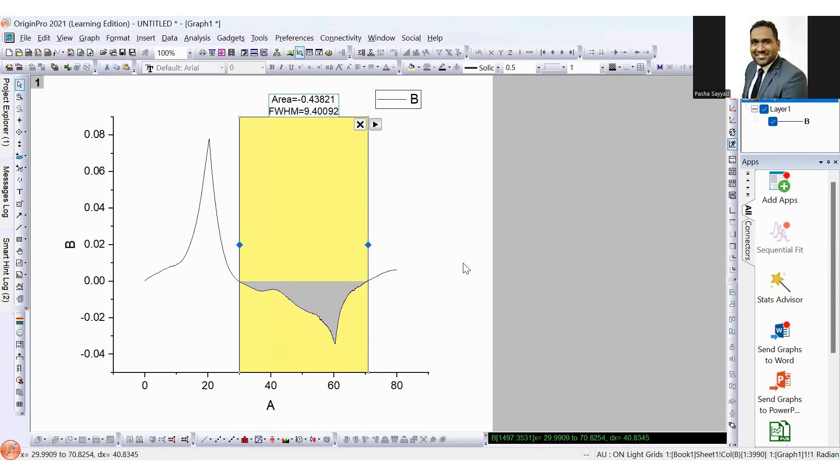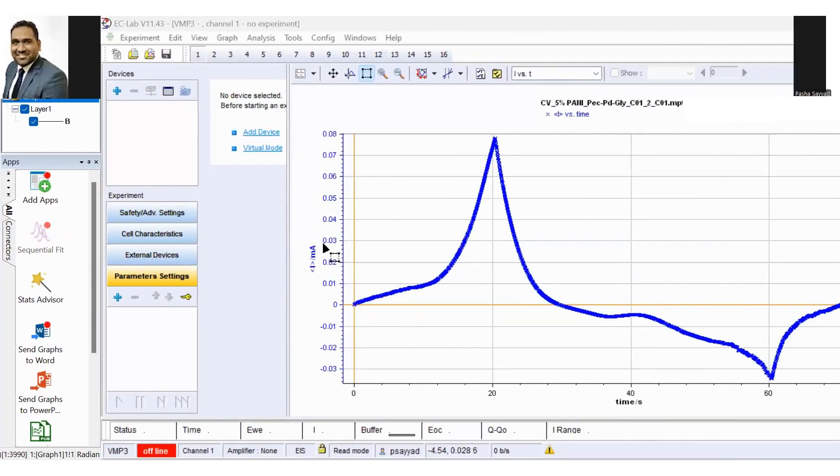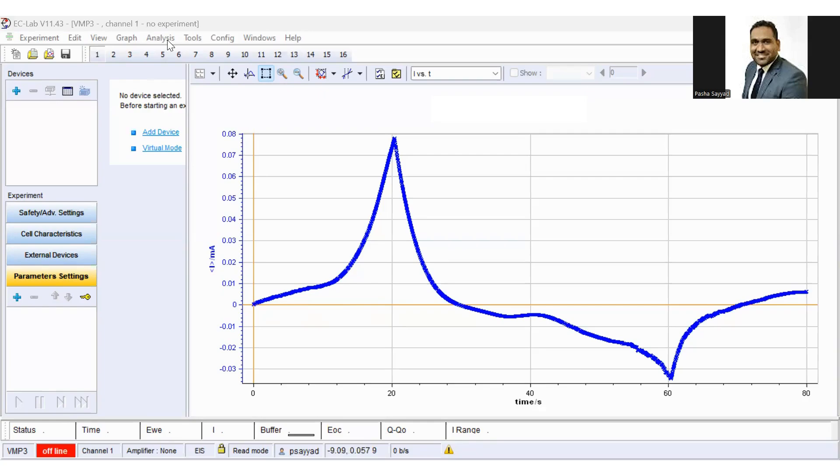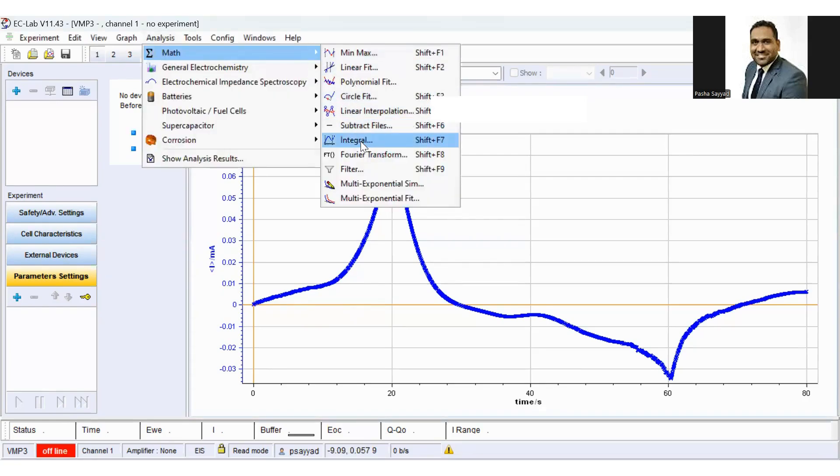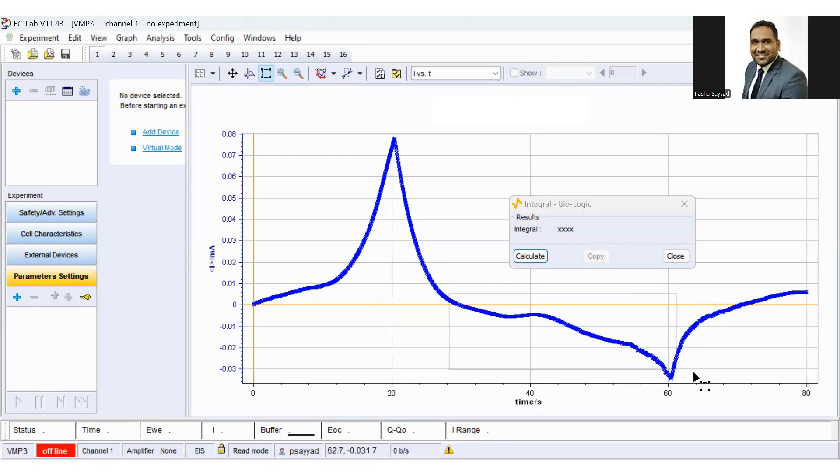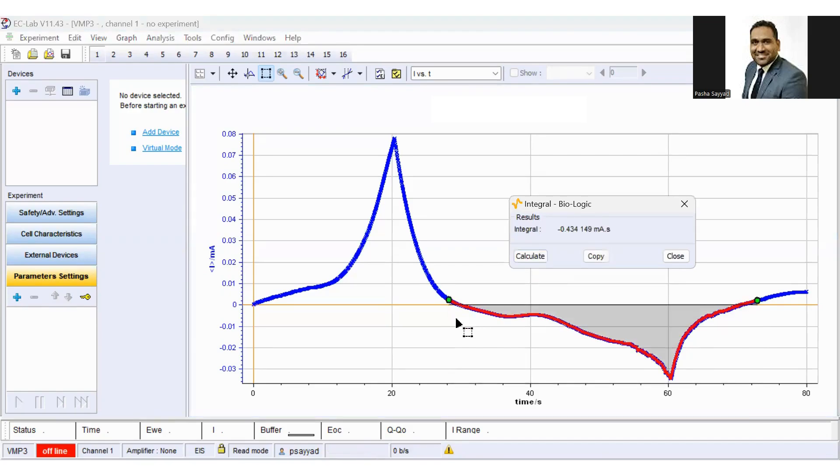Now, let's compare this integral with ECLAB software. This is current versus time curve. Let's calculate integral. To calculate integral using ECLAB software, click on analysis, math, and integral button. Now you can select the area below the baseline zero. We call it during the reduction process. And hit the calculate button.